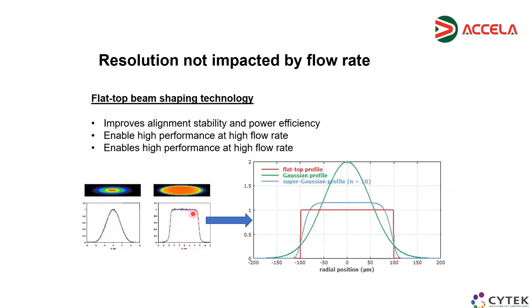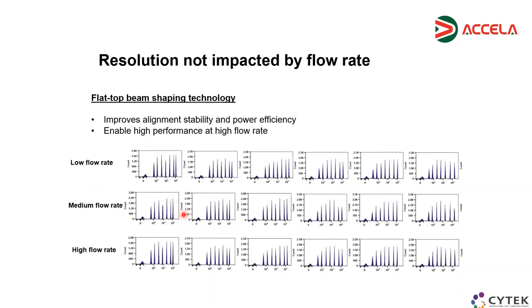and cell number three in here, still all these three cells will generate the same pulse and will have the same quality of detection. So the idea is that at higher flow rate, you might get some doublets, you might get a larger amount of cells, not the classical single stream of cells, but all these cells at different locations will get the same intensity.